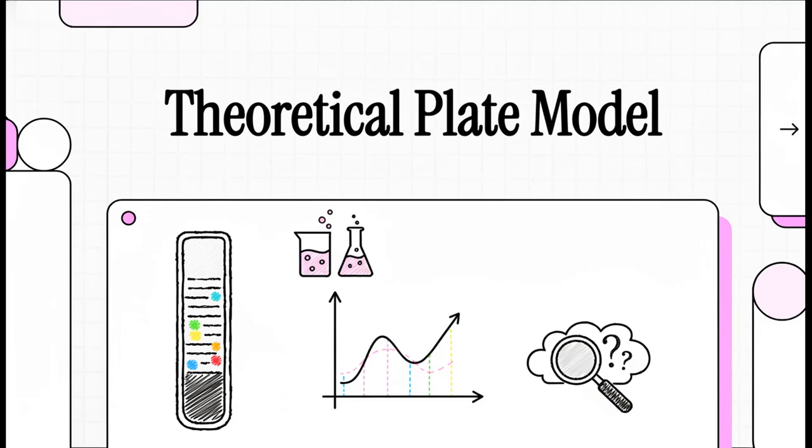Welcome to our explainer. Today, we're diving into a really fascinating paradox hidden right at the heart of modern analytical chemistry. Just imagine a universally used scientific model that is, technically speaking, considered obsolete. It actually relies on physical structures that don't even exist in the real world. Yet, without it, laboratories everywhere would literally struggle to analyze complex chemical mixtures. We're talking about the theoretical plate model in chromatography. Let's unpack how a complete theoretical illusion helps scientists decode physical reality.